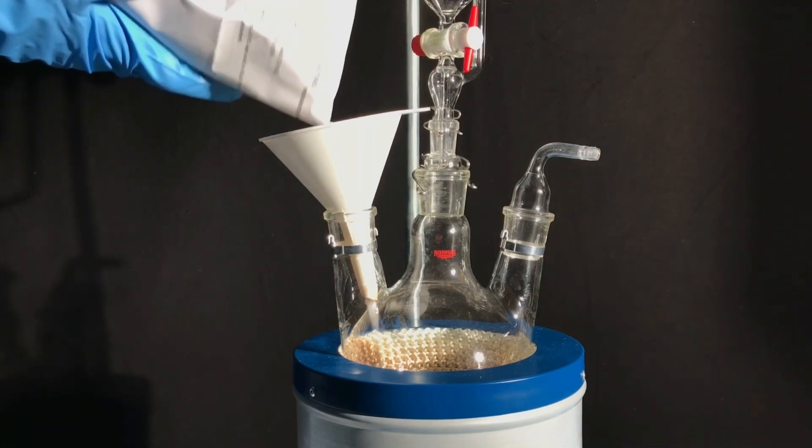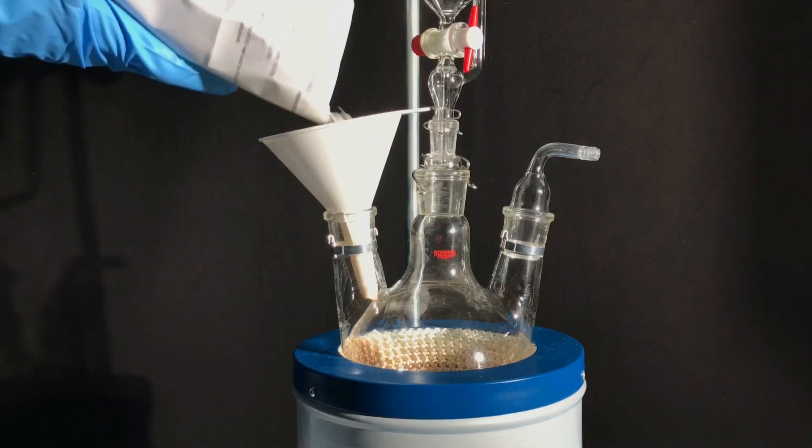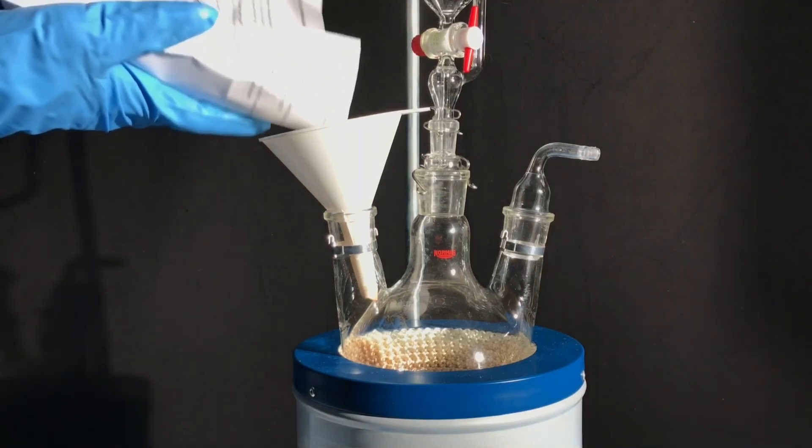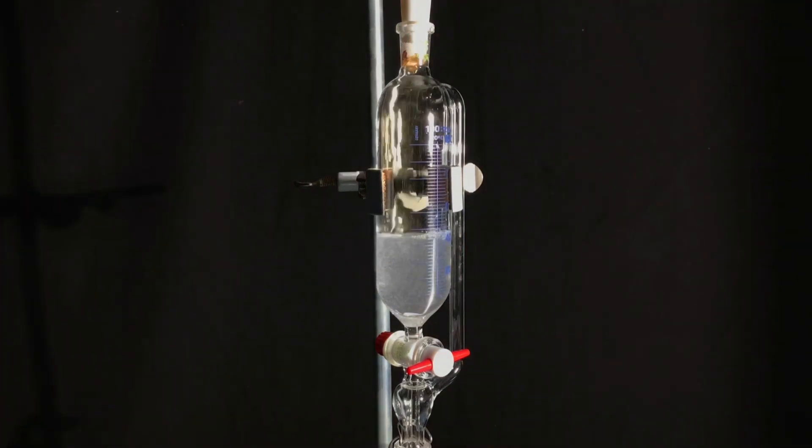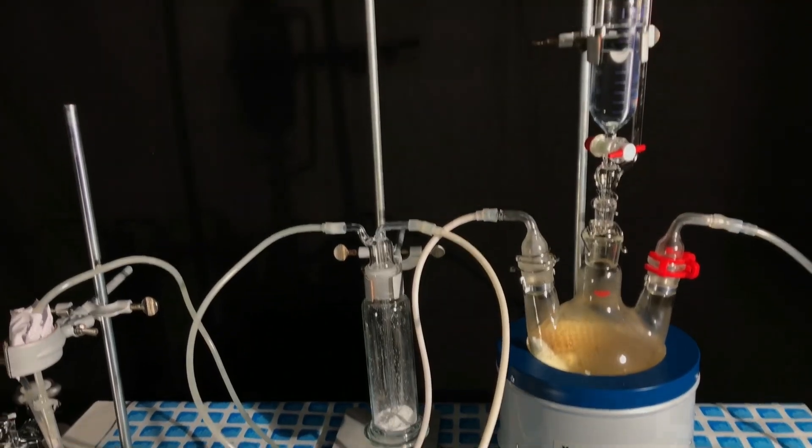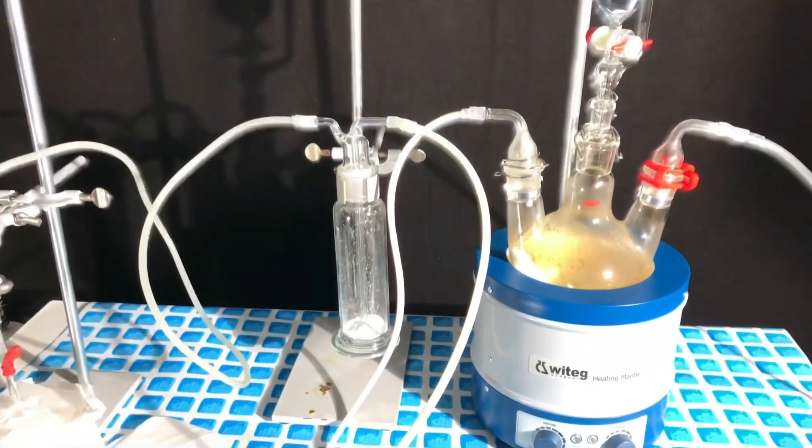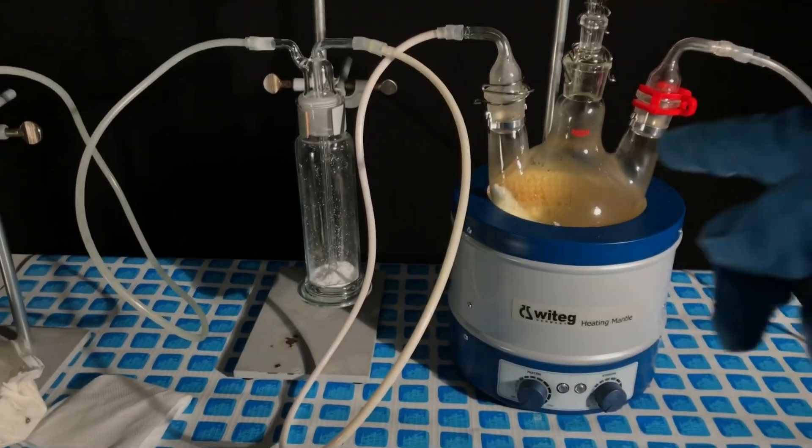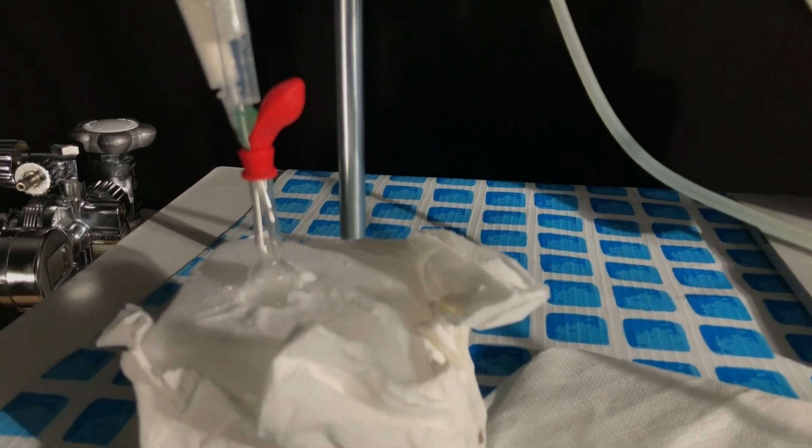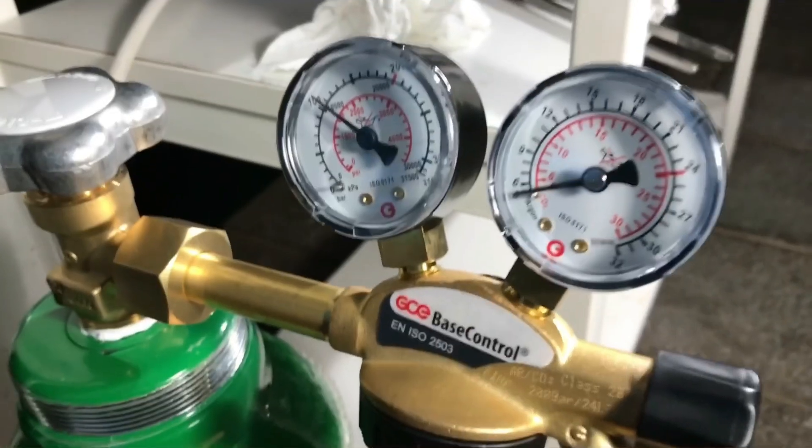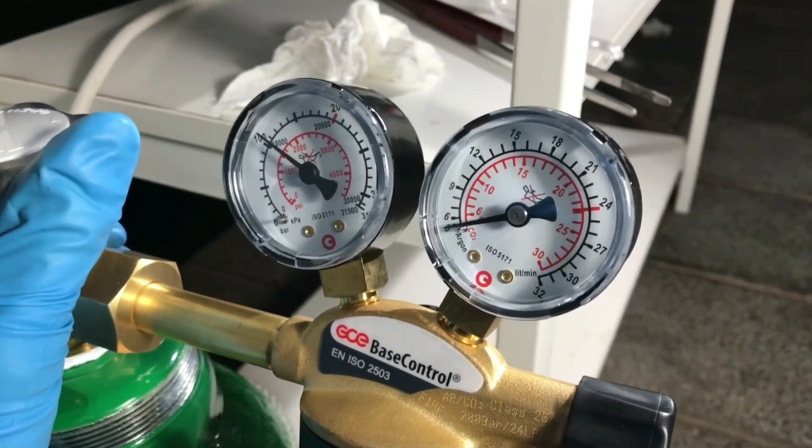We started off the preparation by adding the sodium nitrite to a three neck round bottom flask. The pressure equalizing addition funnel was filled up using 49% sulfuric acid. Here you can see the entirety of the apparatus. Three neck round bottom flask containing sodium nitrite with the addition funnel on top of it, a washing bottle containing phosphorus pentoxide as a drying agent and this ampoule with two syringes stuck into it.